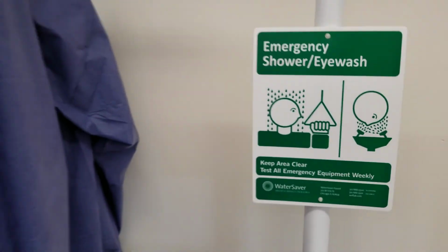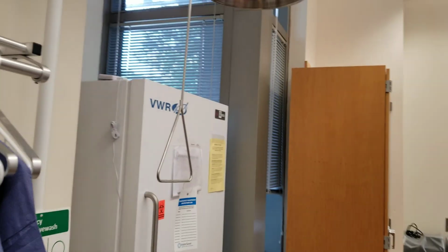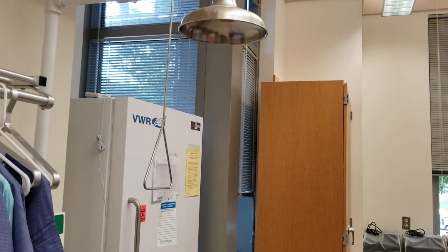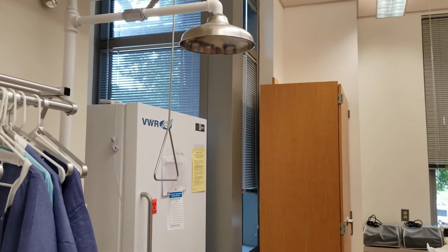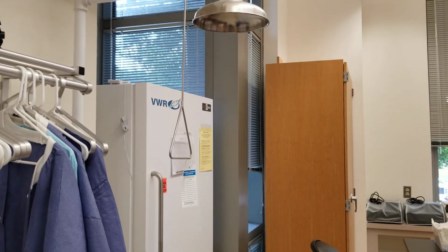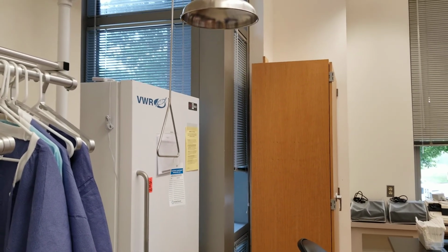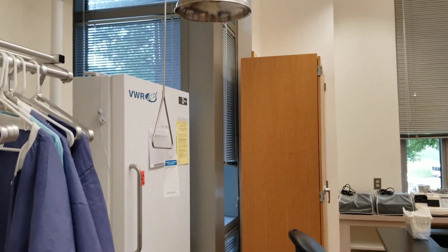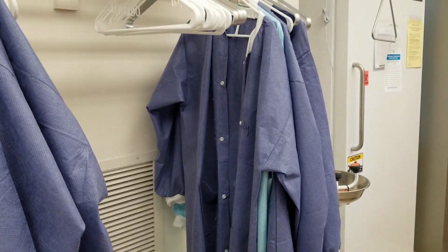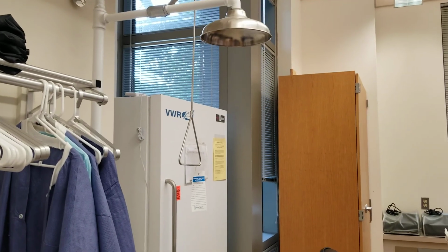If the person needs the shower, the individuals helping them will need to, depending on the coverage of the chemical, have the person strip down, possibly to naked, in order to make sure that they are not being burned by acid, whatever the case may be. In that case, many people will be helping them, including providing some type of coverage such as a lab coat. We would get them a new lab coat so that they would not be cold and naked throughout the time here on campus.